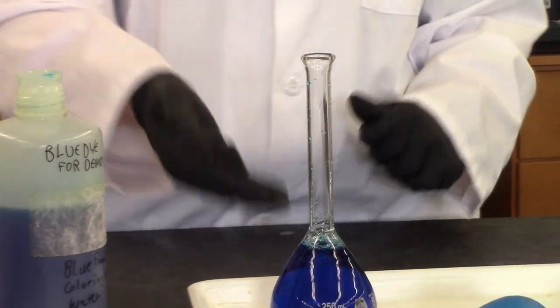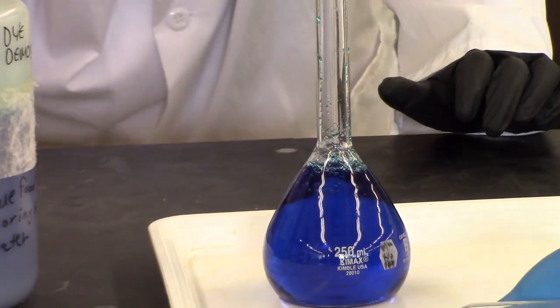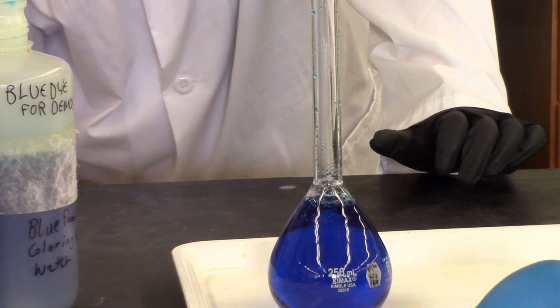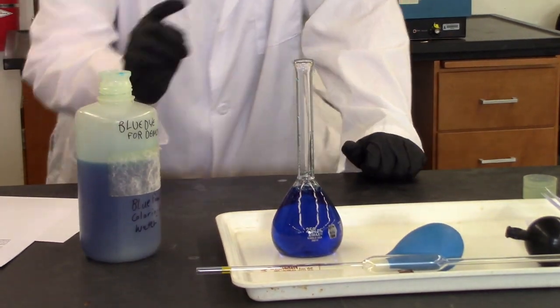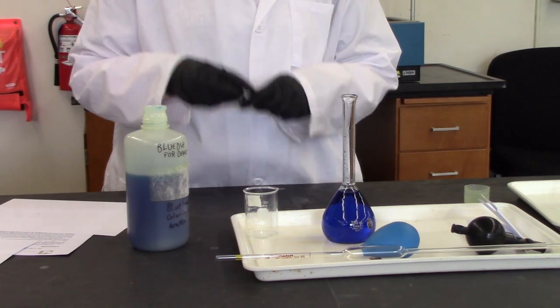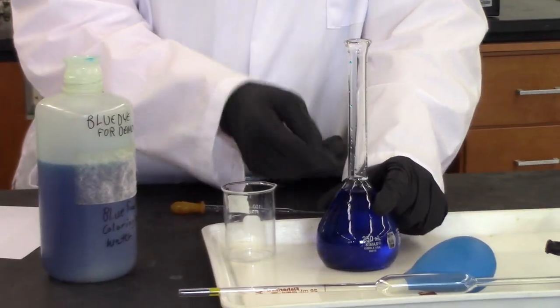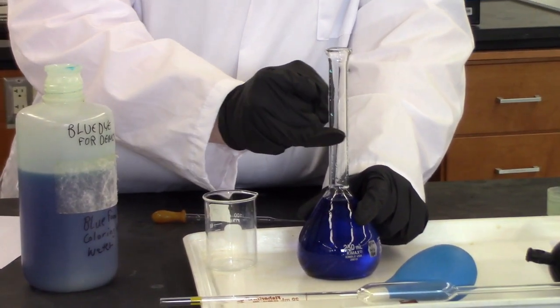So what you're going to do is fill it up till about the neck, all right? And you don't really want to go too much past that simply because it fills up really fast, okay? And each flask has a different marking point. They're each calibrated individually by hand. So we fill it up close to the neck, but I don't want to go too much above that because it fills really quickly. This particular flask has an etched circle right here. So that's ultimately where I'm trying to get my line.